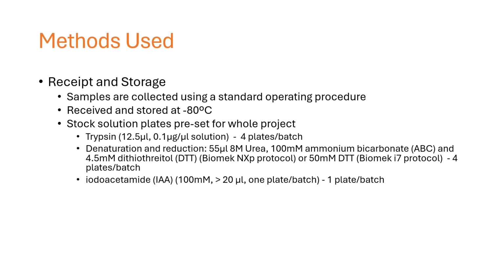Those solution plates include trypsin, four batches each. They have their denaturation and reduction solution, which also comes in 4 batches, and then the iodoacetamide, and that's 1 batch.